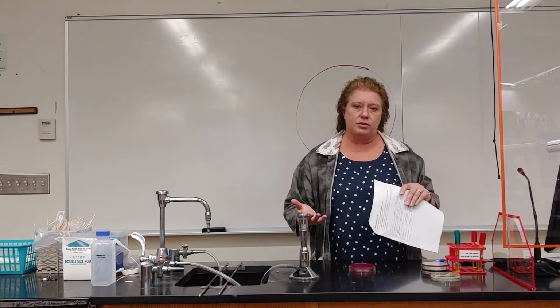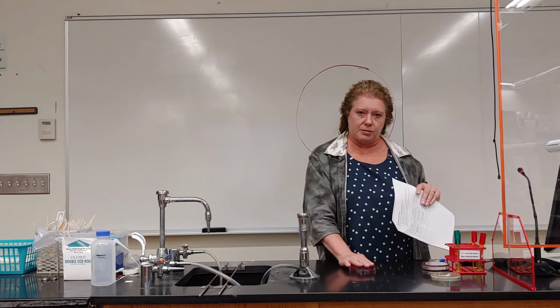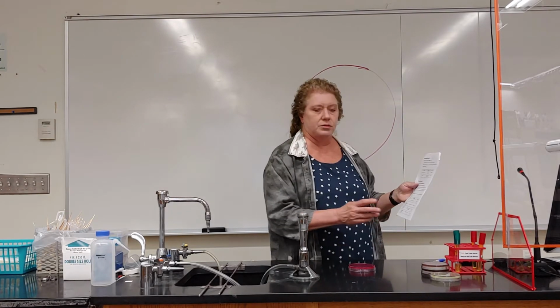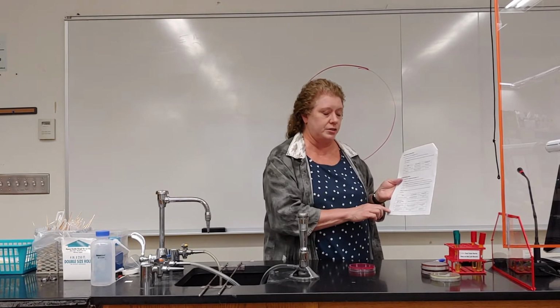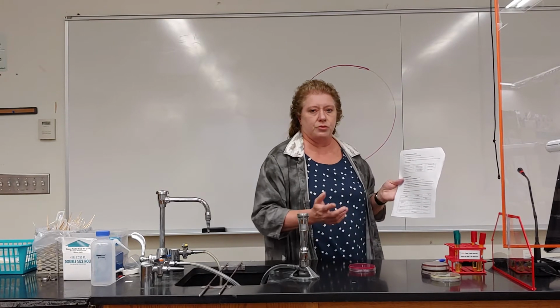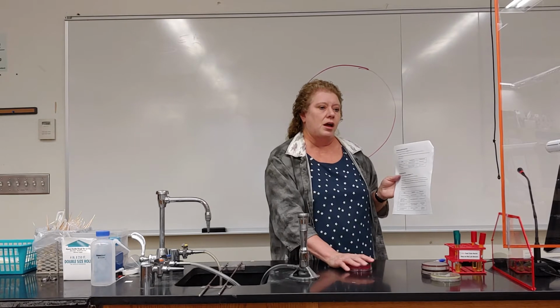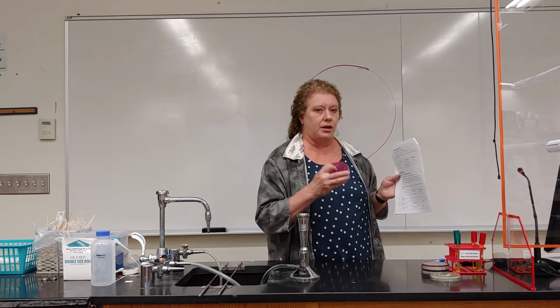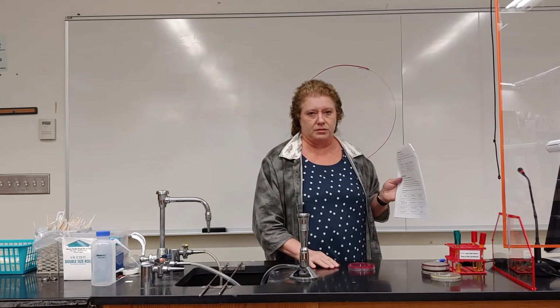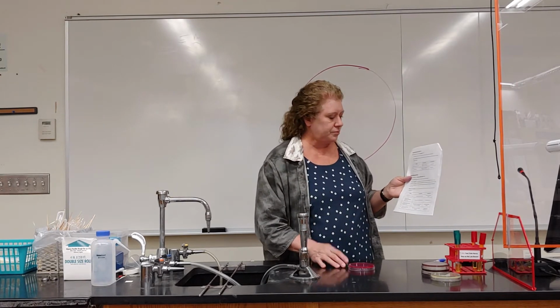So we have an unknown bacteria. We put it on this MSA plate, and then once we have incubated it, we're going to read the results. This one's a little more complicated of a table. So the results could be poor growth or no growth. Say I put E. coli on here, and I incubated it, I look at it, there's no growth on it. The E. coli did not grow.